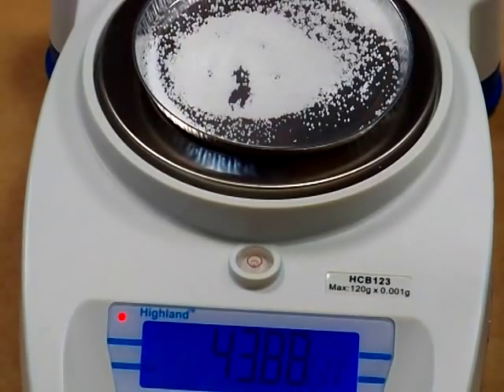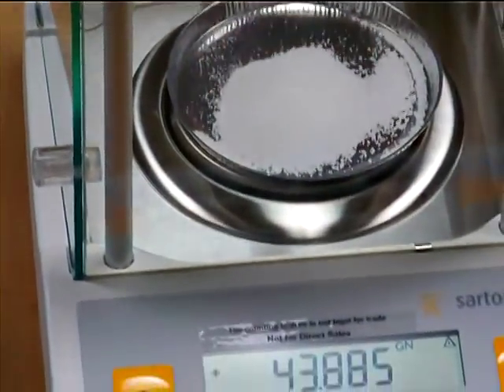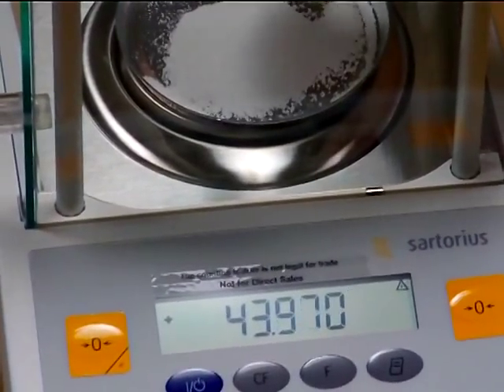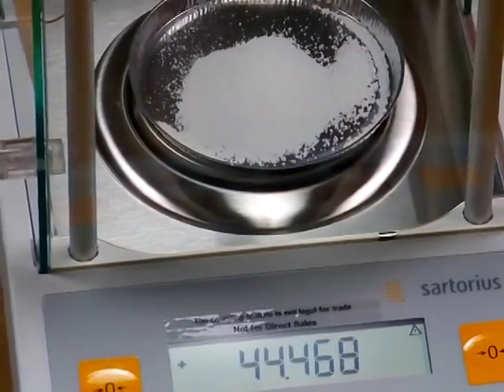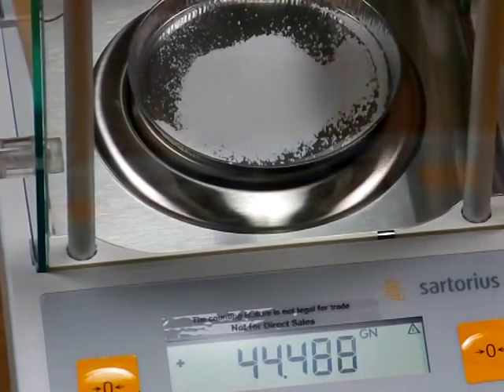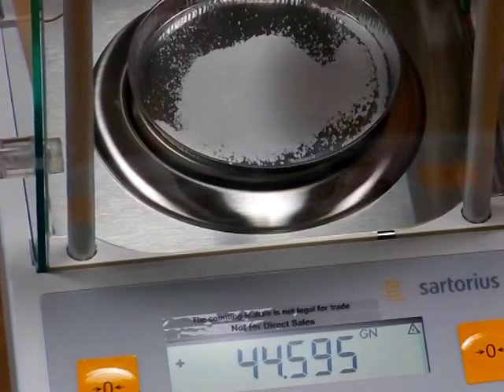Now I'm going to come over to the Sartorius GD503, which is a force restoration balance. On this balance it will pick up everything and respond immediately. As I'm adding salt you can see the numbers move, and once I stop, the numbers stop. I add some more salt — it shows up immediately, and when I stop, the balance stops.